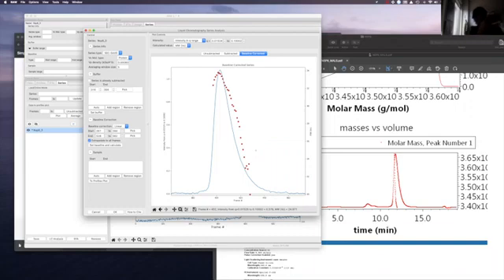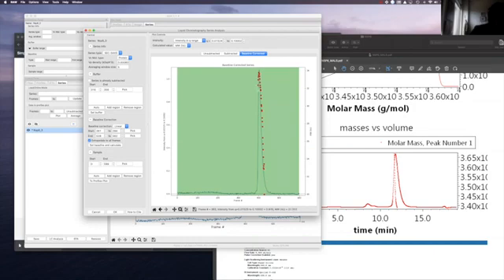This change in the radius of gyration also reflects a different oligomerization state, because you see the molecular weight change from 34 to almost 22. You remember I told you NSP8 at the monomeric state is 22 kilodaltons. So it seems like only the last tail of the elution has mostly the monomeric state, versus here it's something in between monomer and dimer. So already from this information you get the idea of how the sample behaves. When we add the region and select the sample, we'll try to do it.